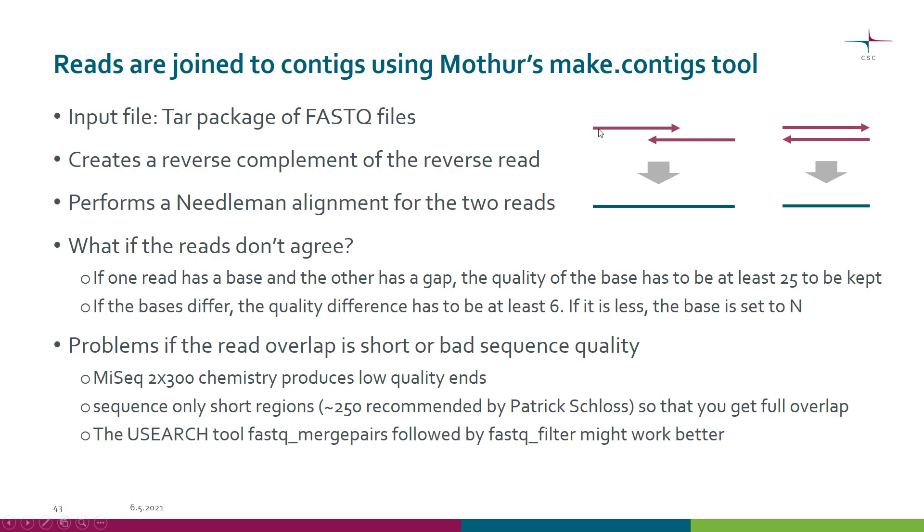Essentially we take our pair of reads and put them together so that we end up with one contig.